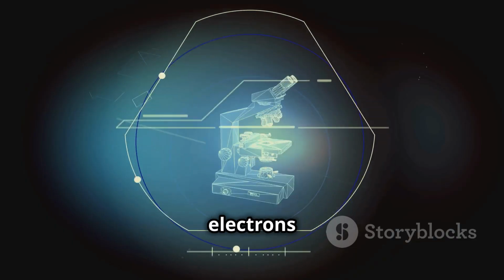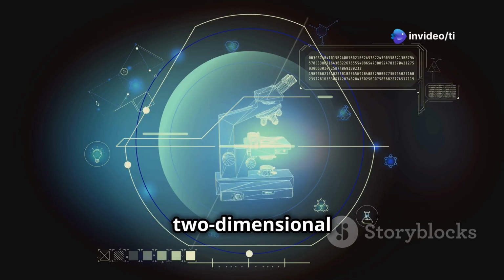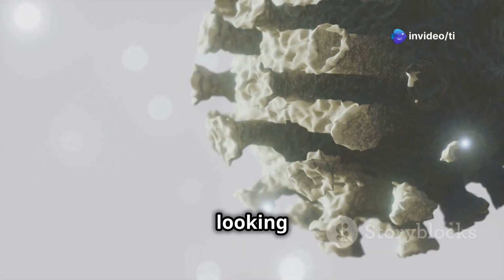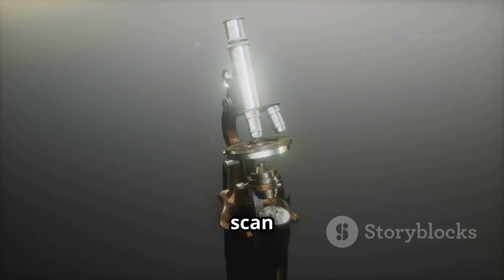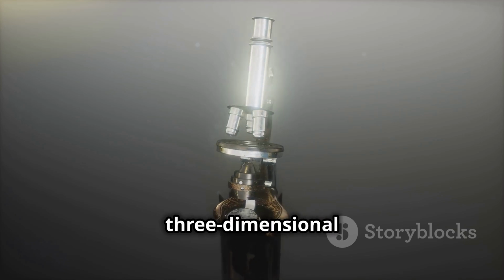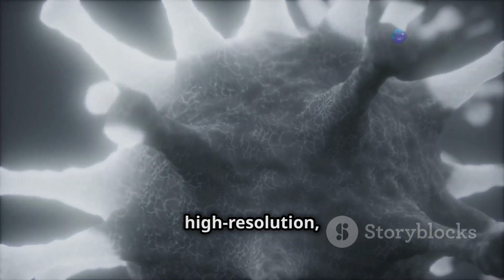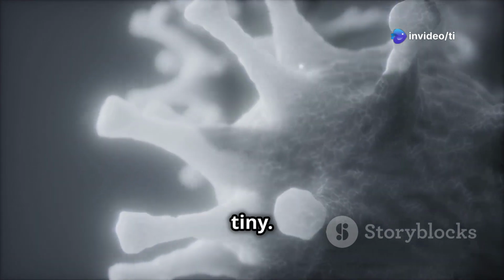TEMs fire electrons through a very thin specimen, creating a highly magnified two-dimensional image. Think of it like looking at the shadow of something incredibly small. SEMs, on the other hand, scan the surface of a specimen with a beam of electrons, creating a three-dimensional image. It's like taking a high-resolution, close-up photograph of something unbelievably tiny.